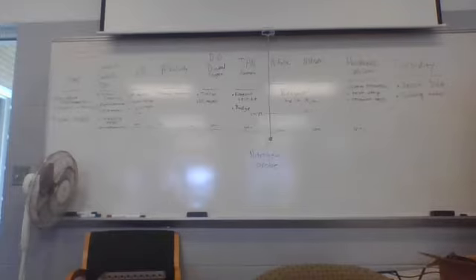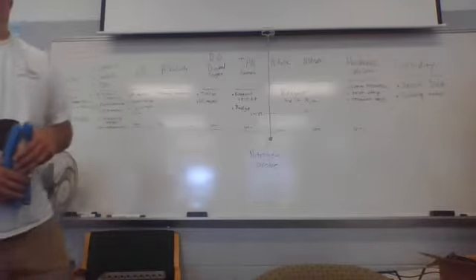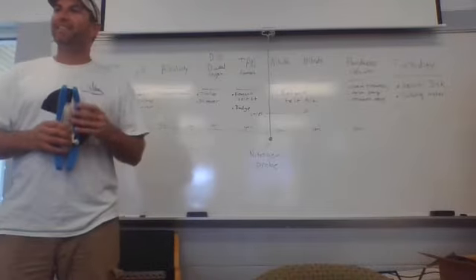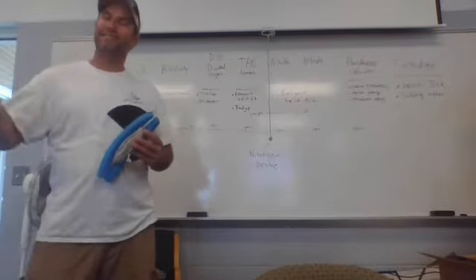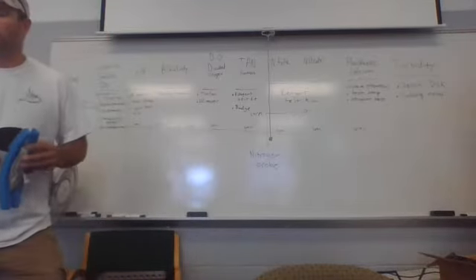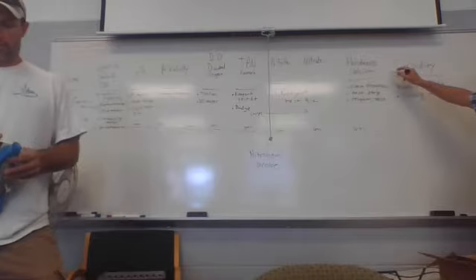Oh, the book, sorry. Yeah, or an index in the back. For those of you that are addicted to Google. So the light penetration through the water is basically what the meter is measuring.